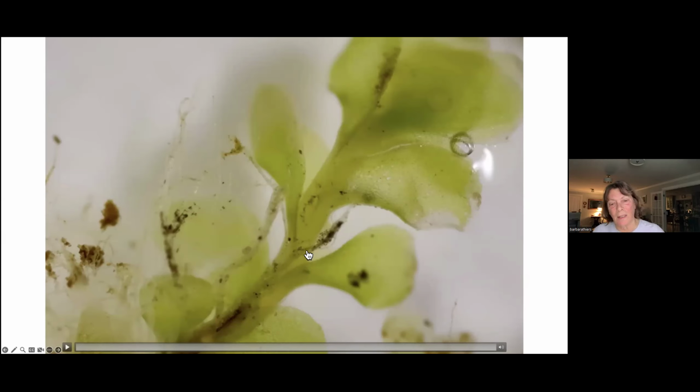And it's not as dramatic as in some species. In some species, it might go all the way down to the next leaf, but truly, there is a part that's going down here. And so I can say, yes, indeed, that is decurrent.